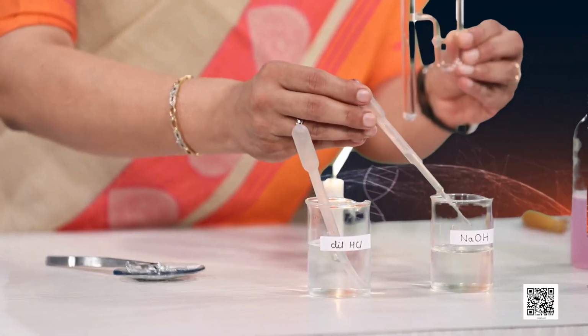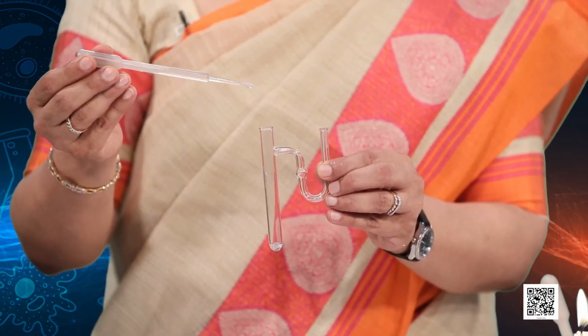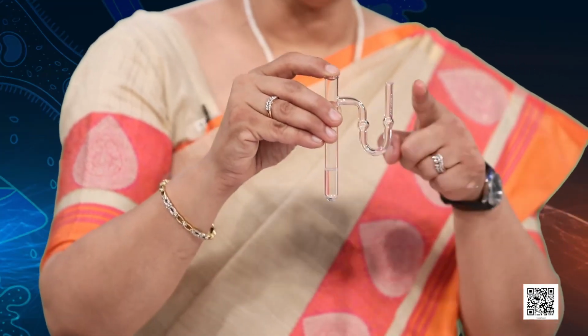And now, I will put some sodium hydroxide. Again, I would say that this reaction has to be done in the presence of adult guidance. Sodium hydroxide solution has to be prepared a little concentrated, and now when I put it in this, a little warming is required. Before that, I will put some soap solution again. Okay. So, I have here zinc metal, concentrated sodium hydroxide solution and soap solution in the arm.